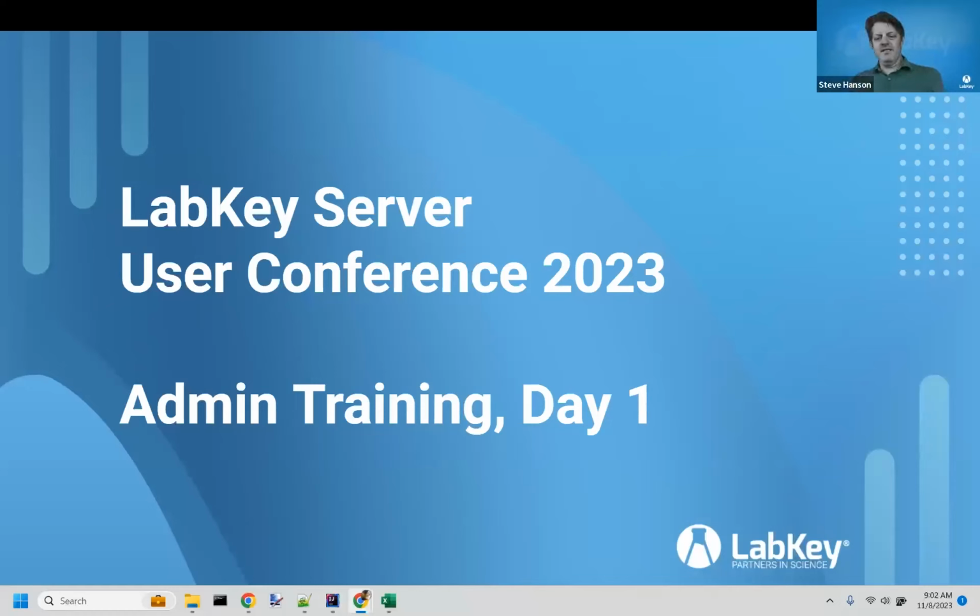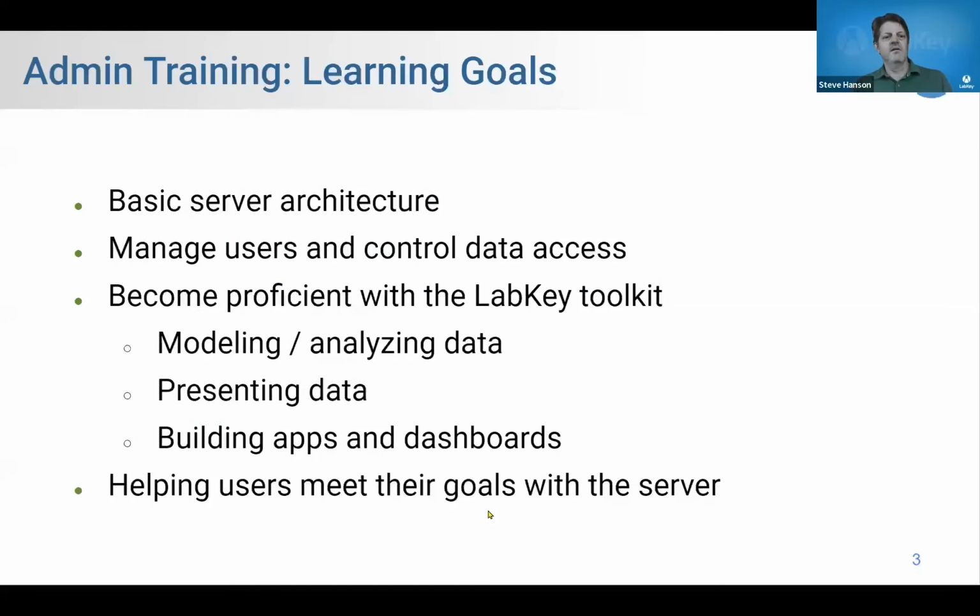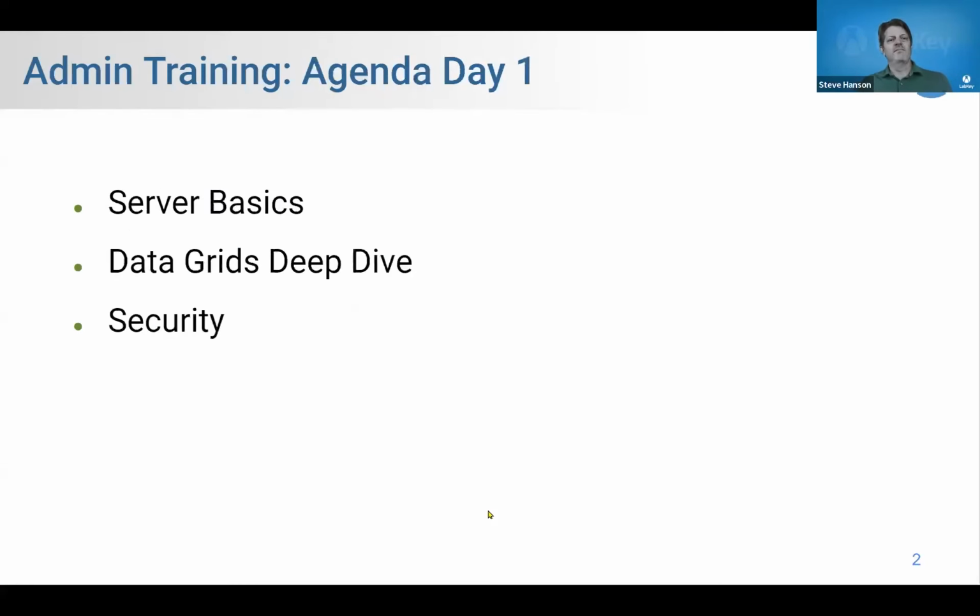In any case, let's take a look at the agenda here. So today, I want to do 3 topics. I want to look at the basics of the server: what is the server, what's the whole point of it, what does it do? I also want to take a look at security and how to control access to your data and your reports. In between the two, I want to do a little deep dive, a little mini unit on data grids. So that's our agenda for today.